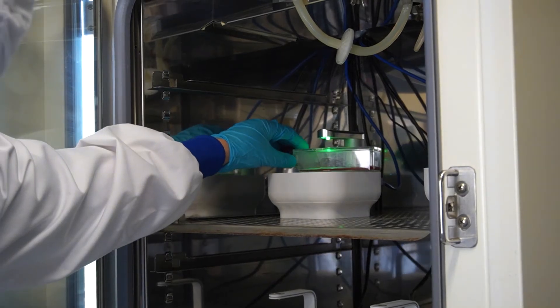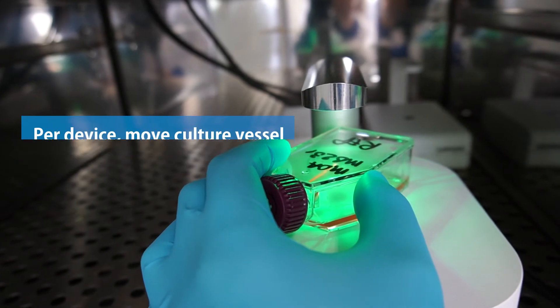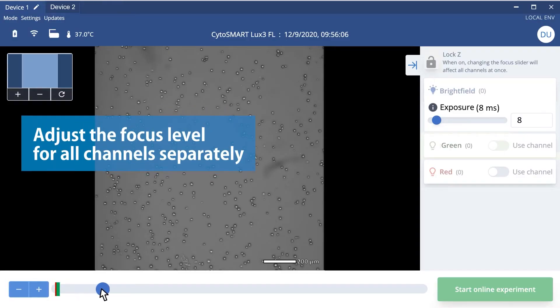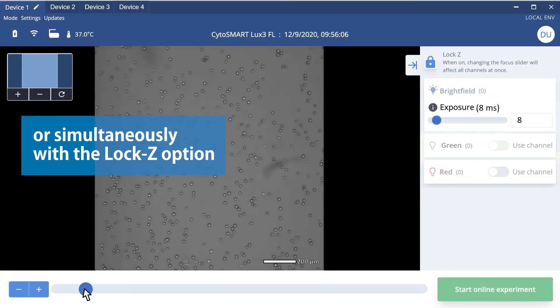Per device, move each culture vessel to image your desired location. Adjust the focus level for all channels separately or simultaneously using the Lock-Z option.